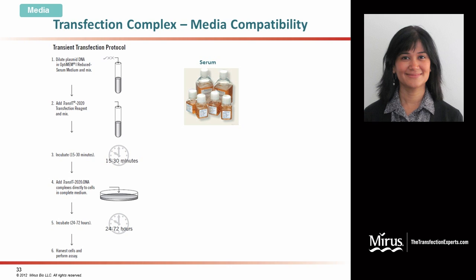factors in transfection. The reason serum-free media is recommended for preparing pretty much all the transfection complexes across different transfection reagents is because serum is known to contain nucleases that are likely going to chew up your nucleic acid substrates even before it sees a transfection reagent. So it is an absolute no-no to use serum-containing media for complex formation.